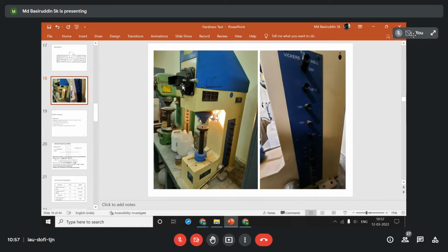After measuring the indentation through this viewing screen, you will be able to measure the small d. Whenever you are doing this test, your operator will tell you what the indenter diameter was and what the maximum load was. For this particular machine, your maximum load is 250 kgf. If you follow the relationship P by D square, you will be able to calculate the indenter diameter. Then by putting in the indenter diameter and the measured small d values, you will be able to find the small d by capital D ratio.